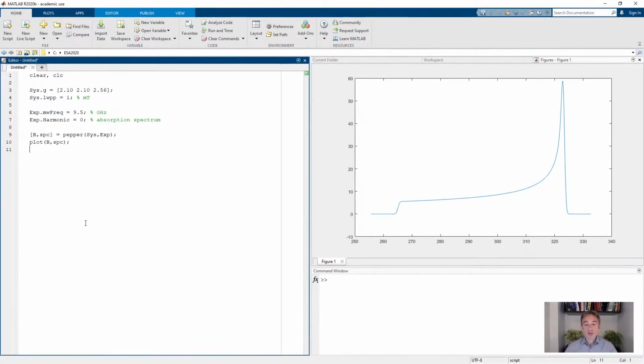So there are two major things in which simulations in solid state differ from liquid state. First of all, you always need to include the full G tensors. In a liquid state simulation, you could supply this type of full G tensor, but garlic would just then take the average and use the average G value for the simulation. But for solids, you always have to specify the full tensors because the molecules don't move, and so you will have anisotropy. The spectrum will depend on how the molecule is oriented in the spectrometer. And since you have all orientations, we're going to sum over all these different spectra to give the full, what we call the powder spectrum.